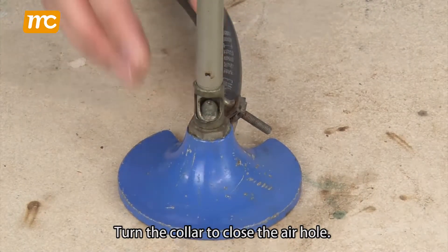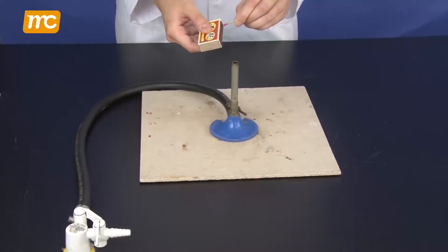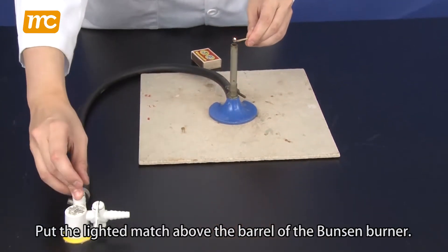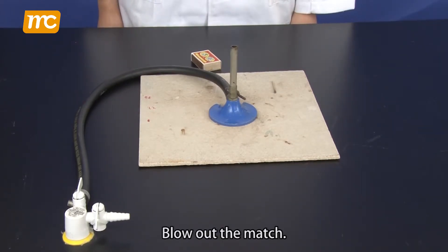Turn the collar to close the air hole. Always close the air hole before lighting a Bunsen burner. Light a match and put the lighted match above the barrel of the Bunsen burner. Turn on the gas tap slowly to produce a flame, then blow out the match.